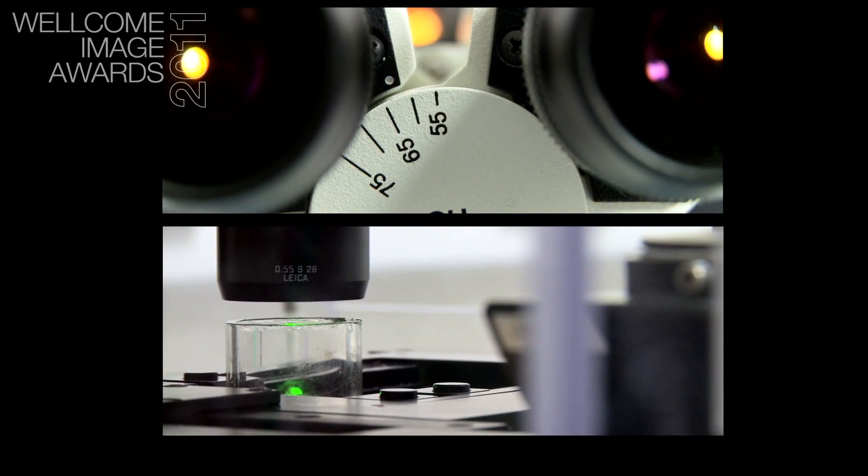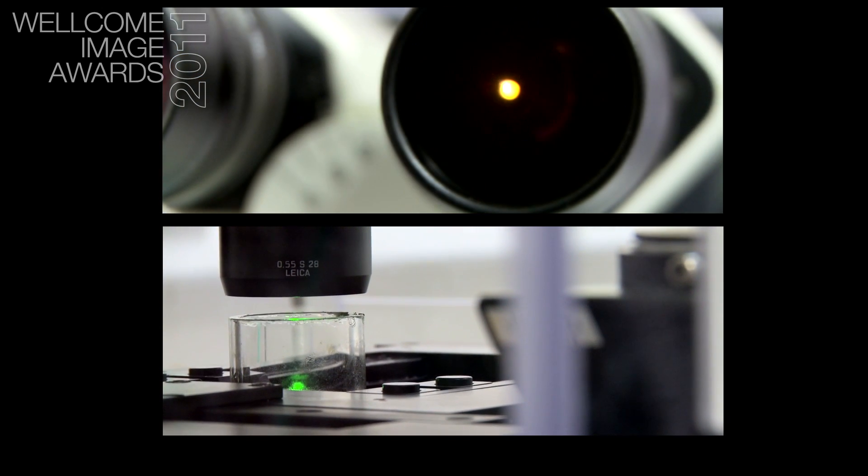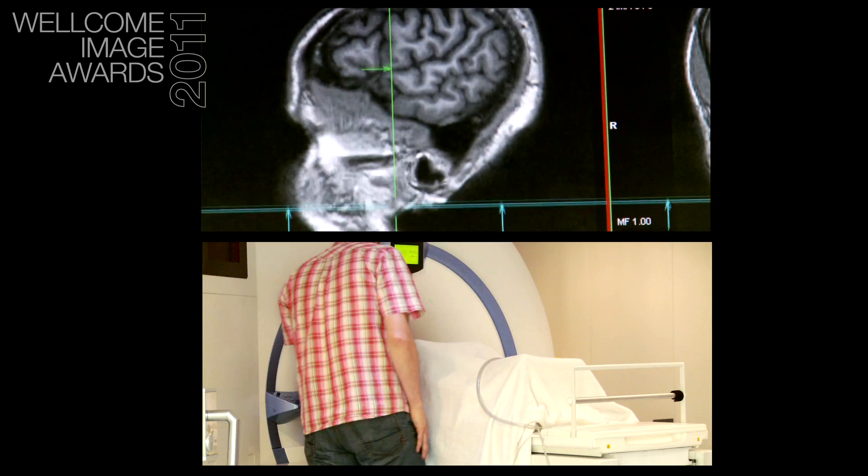Before OPT there was a kind of imaging gap, where it was easy to take three-dimensional images of very small microscopic specimens with something called a confocal microscope, and it was easy to take three-dimensional images of a whole human with things like MRI and CT scanning.